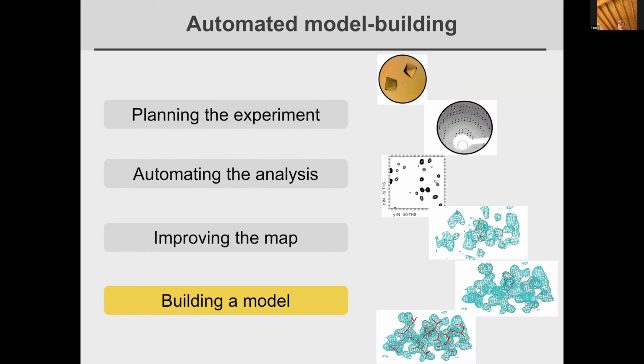So the idea here is, let's suppose you have a molecular replacement solution for your structure, but maybe it's not that great, or you weren't able to completely complete the structure with just that molecular replacement. But you were able to incorporate selenomethionine or some anomalously scattering atom by soak, something like that.